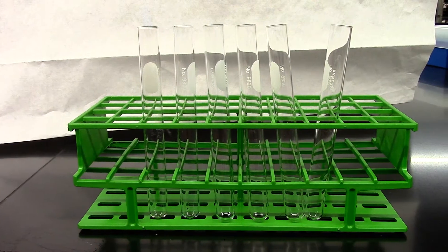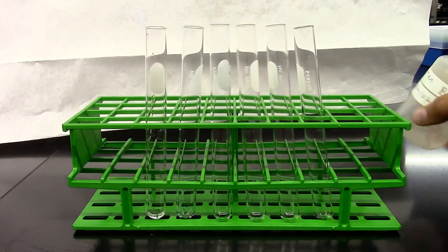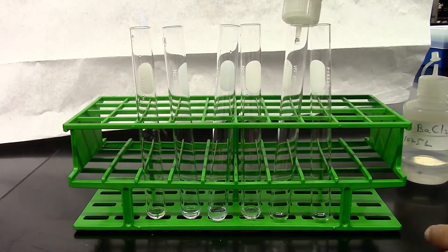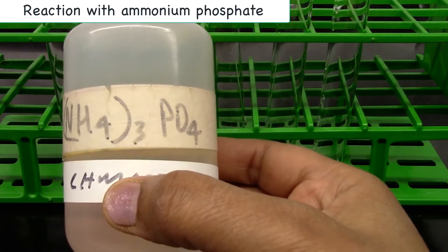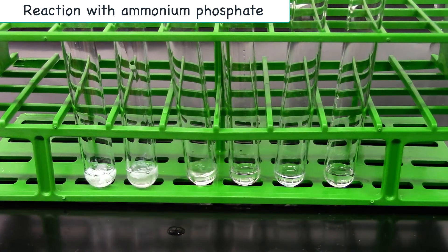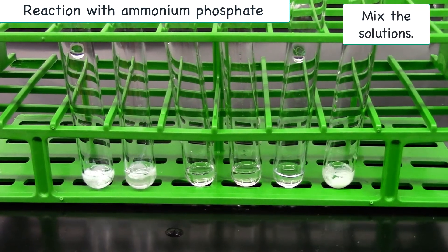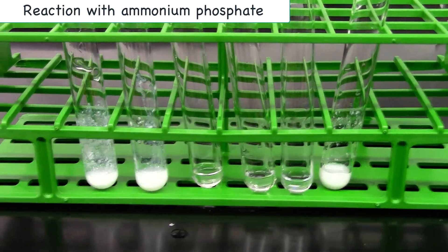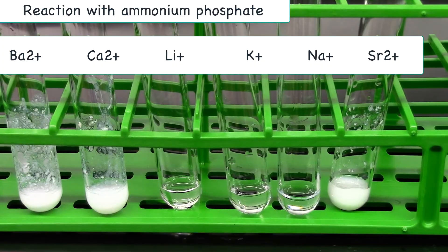We start with six clean test tubes and then add 10 drops of each metal ion solution. To all of these test tubes I'm going to add a few drops of ammonium phosphate. Record your observation as precipitate or no reaction.